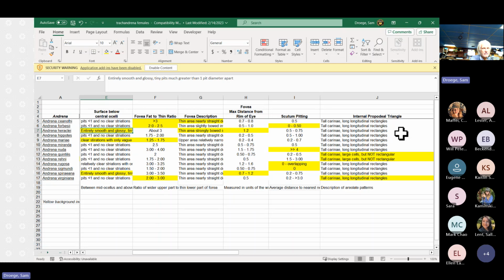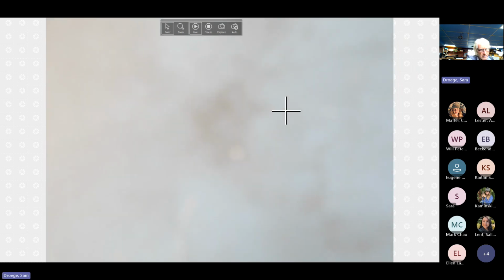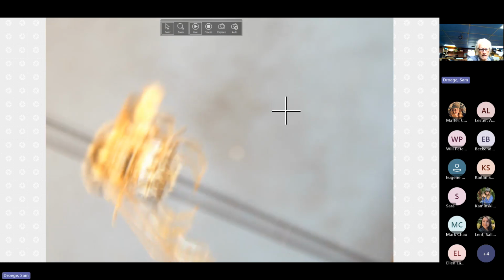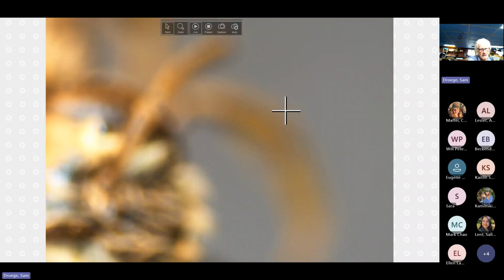Okay, so we're going to look at the face and we're going to look for this very shiny portion of the head. Okay, so hopefully we're seeing the microscope screen here. And Claire will mention if it... We have it. All right, not there.